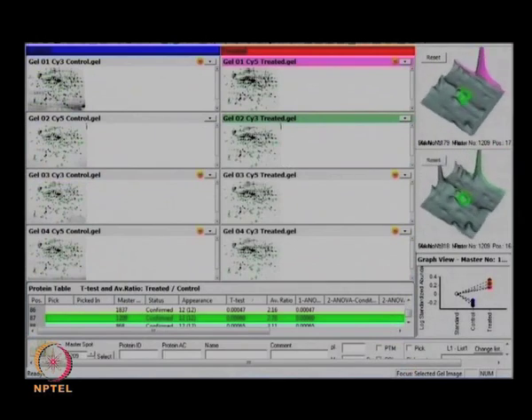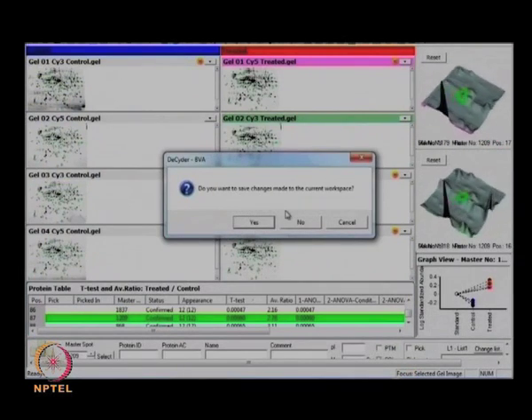Very shortly, I will show you briefly. So if I understood correctly, probably the statistical parameters will be more stringent in EDA, and you can have some better biological significance information from the data set. Exactly. Because in a lot of clinical data or different types of treatments, people like to do several gels and a lot of treatments. Yes. So your number of samples to be analyzed is very large. Exactly. And obtaining meaningful information is one of the major challenges in the proteomics field. So I'd like to see an EDA. Please.